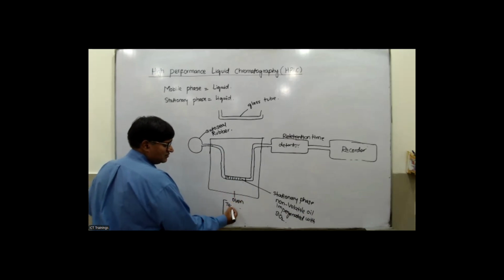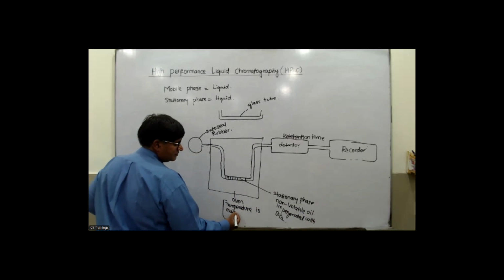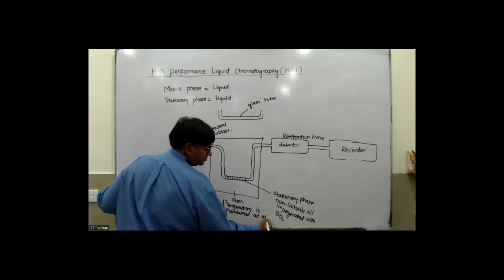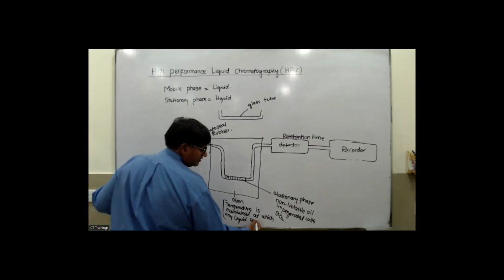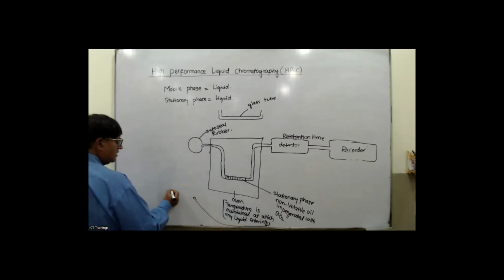Okay. So this is the oven, the temperature is maintained at which any liquid entering from outside would vaporize.